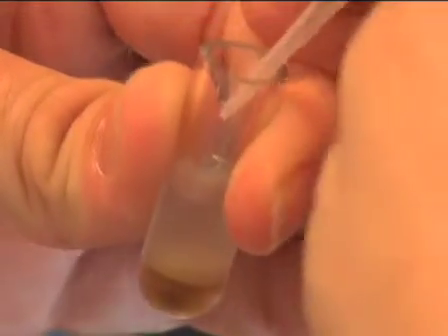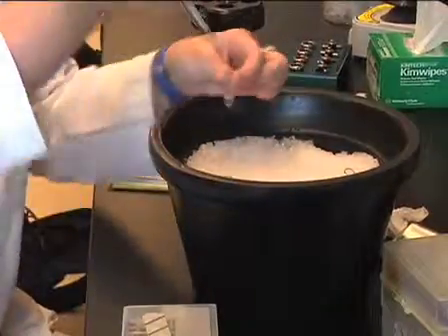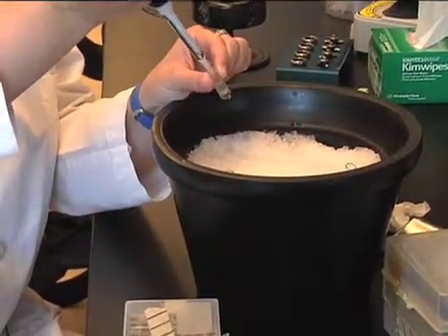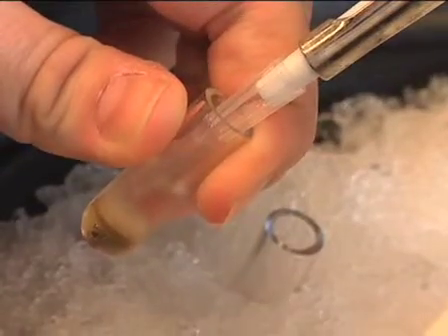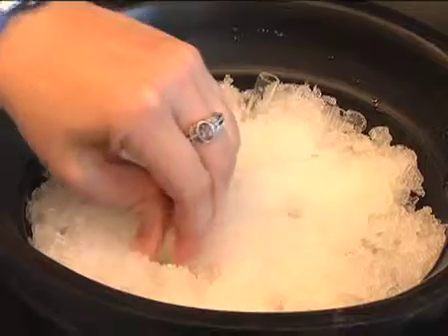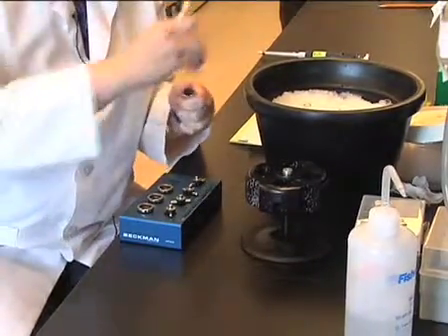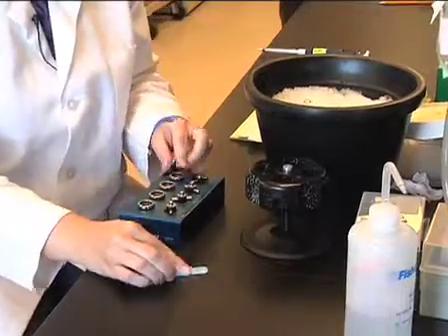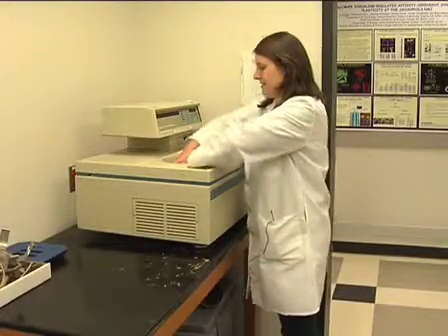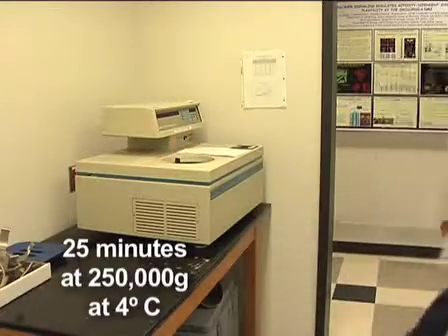Keeping the extract on ice, remove the clear soluble fraction with a cutoff 200 microliter pipette tip, taking care not to disrupt the light membrane layer. Retain both the cytoplasmic fraction and the membrane layer and keep on ice. Next, centrifuge the soluble fraction again in a new 2.5 ml ultra-clear centrifuge tube for 25 minutes at 250,000 g's at 4 degrees Celsius.